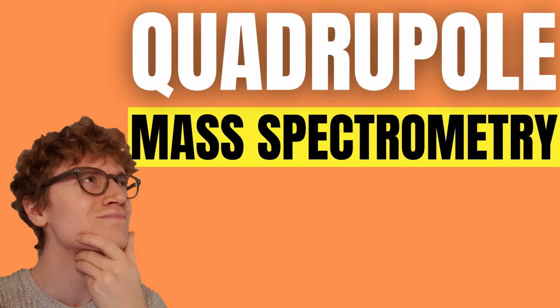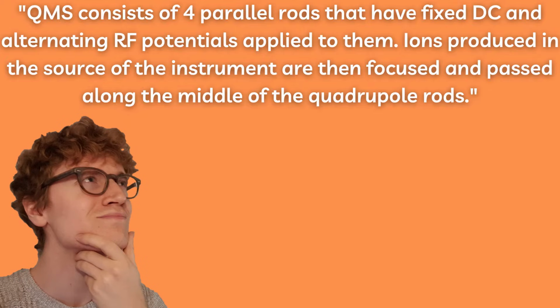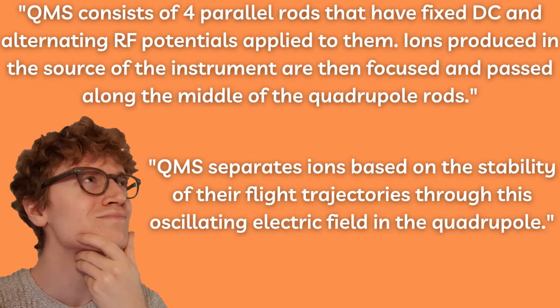However, today we are taking a closer look at another mass analyzer used in mass spectrometry, namely the quadrupole ion analyzer. Broadly speaking, the QMS consists of 4 parallel rods that have fixed DC and alternating RF potentials applied to them. Ions produced in the source of the instrument are then focused and passed along the middle of the quadrupole rods. QMS separates ions based on the stability of their flight trajectories through this oscillating electric field in the quadrupole.